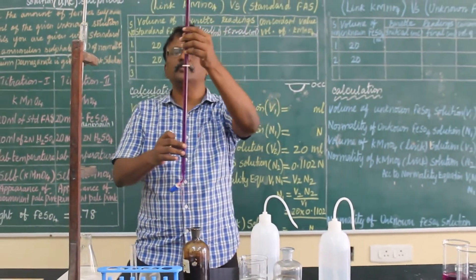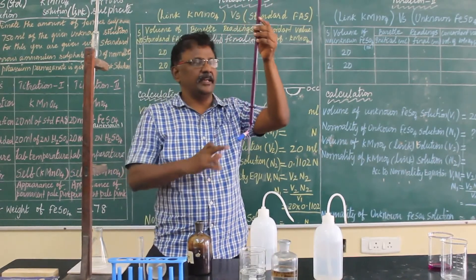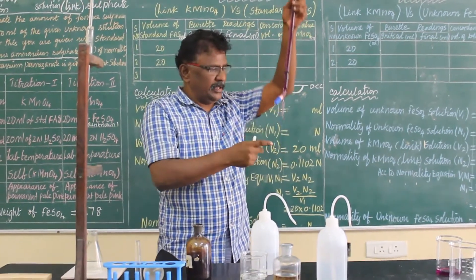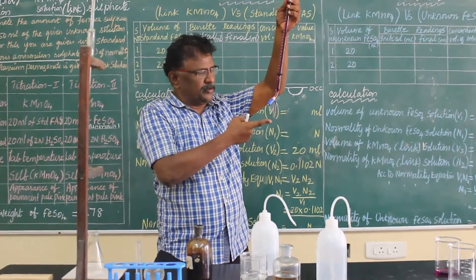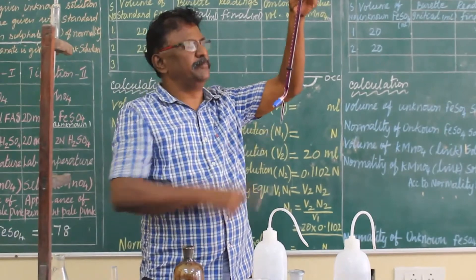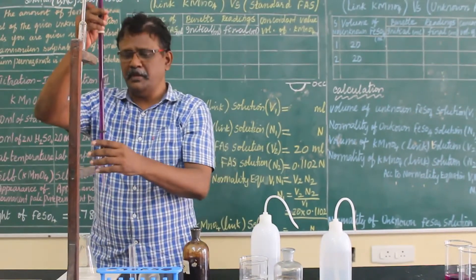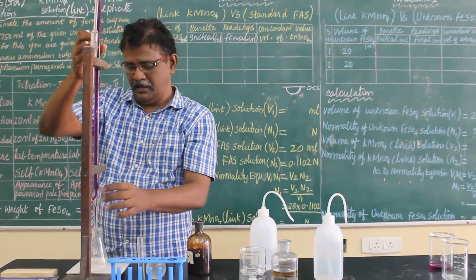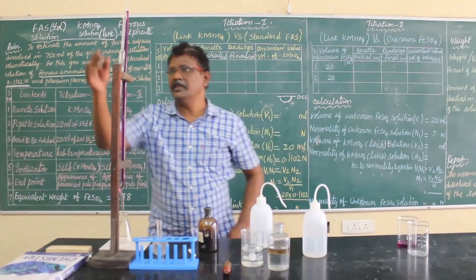Before you take the burette into the stand, make sure there is no air bubble in the burette. You also have to see that you have filled the burette solution till the mouth of the burette. These are the things you have to check before you fit it into the burette stand. Now we come to see how to fill the pipette solution.